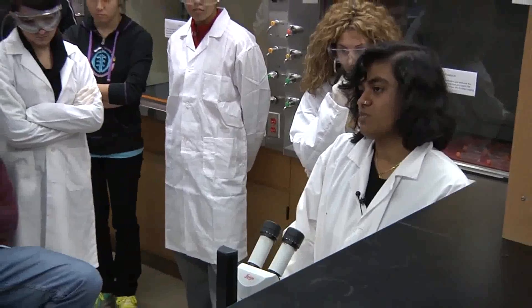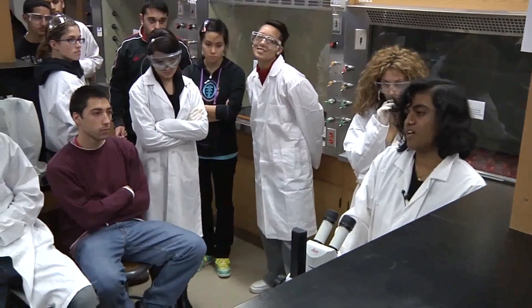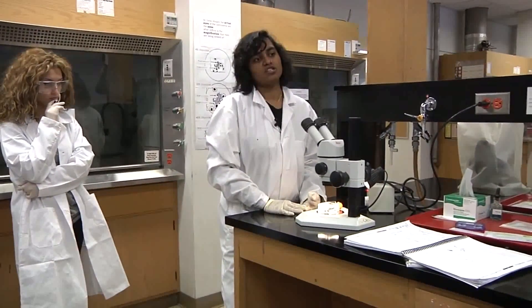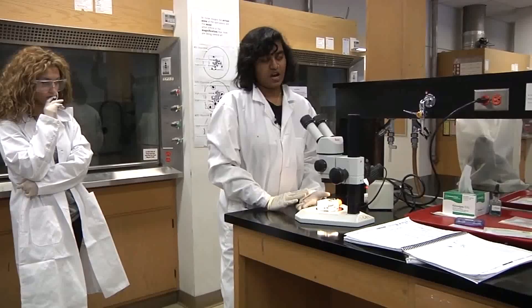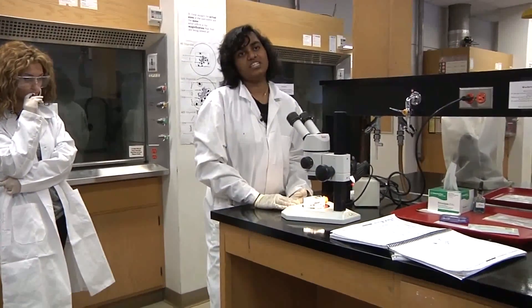Once you have your specimen in focus, write a detailed description in your lab manual: the number of legs, the length, the color, whether it is transparent, how many eyes it has — so all of your boxes have to be filled with detailed descriptions.